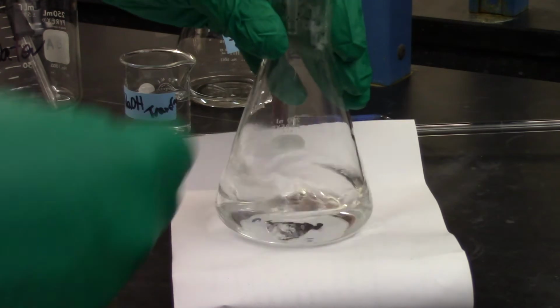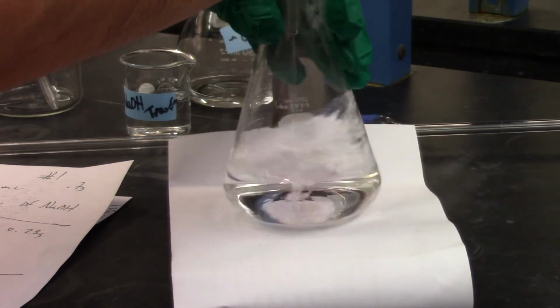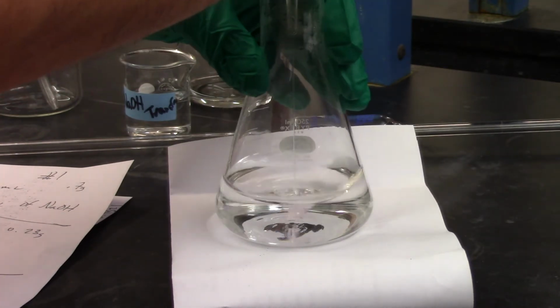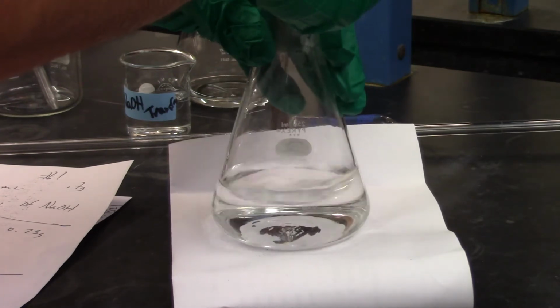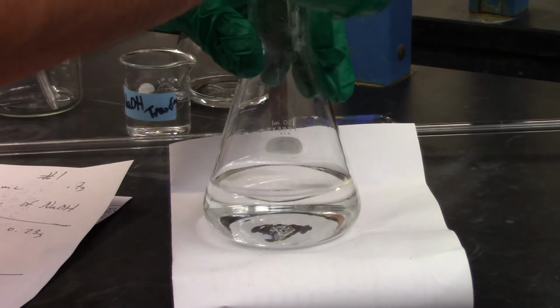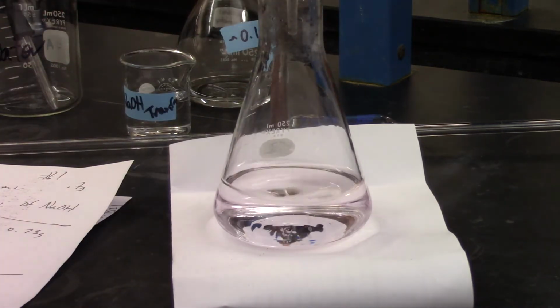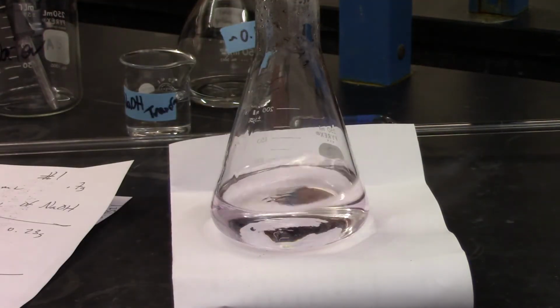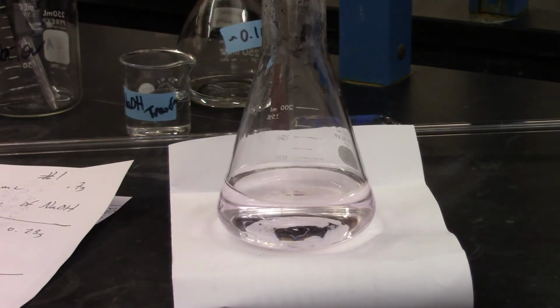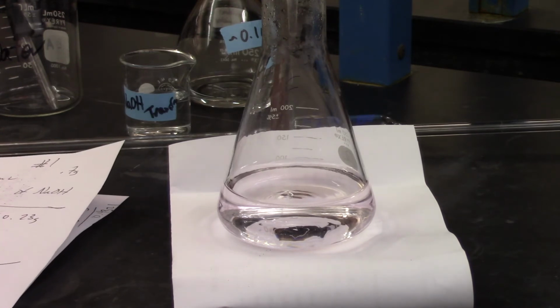It's always good to stop, give it a swirl, allow everything to react there. 28. 31. 33. Oh, I don't know if you can see that, but there's a slight tint of that pink. So I'm going to write 33.60 milliliters.